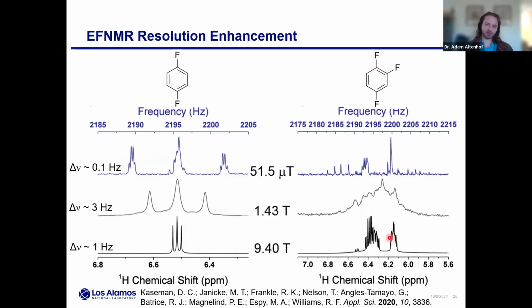And compare this to a case where now there's actually chemical shifts. You can see at benchtop, which is the sort of comparison in terms of price point, the resolution is really just not there. Whereas in Earth's field, relying just on the J couplings, with the really high resolution, this is enough to fully characterize the system by way of J coupling. Again, access to the sign. And I leave this to the audience. You tell me which of these spectra you would ultimately want to characterize your sample.